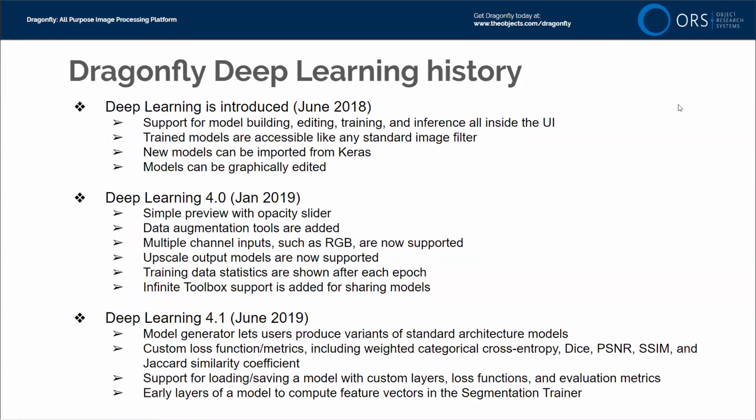So since early 2019, you have had the ability to train models with multiple inputs, such as secondary electron and backscatter electron. And as I was just saying, we will be presenting on that in the CCEM workshop on May 1st and April 30th. I think this will be introduced in the May 30th lecture. We'll talk a little bit more about multiple input channels in a few minutes.